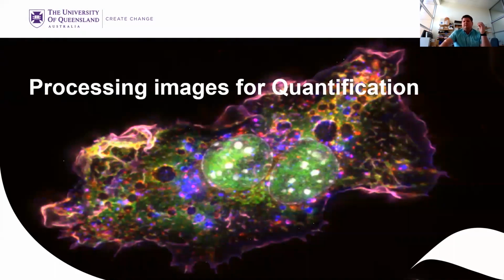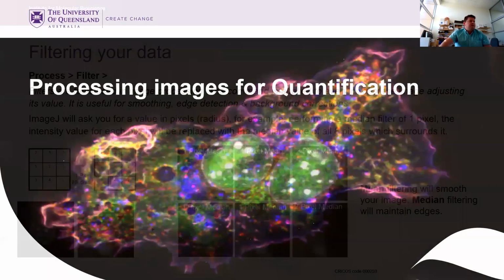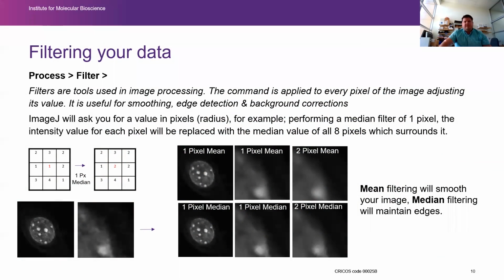So you could imagine that you can do these area, shape descriptors, and intensity measurements on regions. But how do you generate the regions automatically? Well, that's where we do this pre-processing step. Generally speaking, a normal image is going to have some degree of noise. You might be able to see that this image has some background noise.